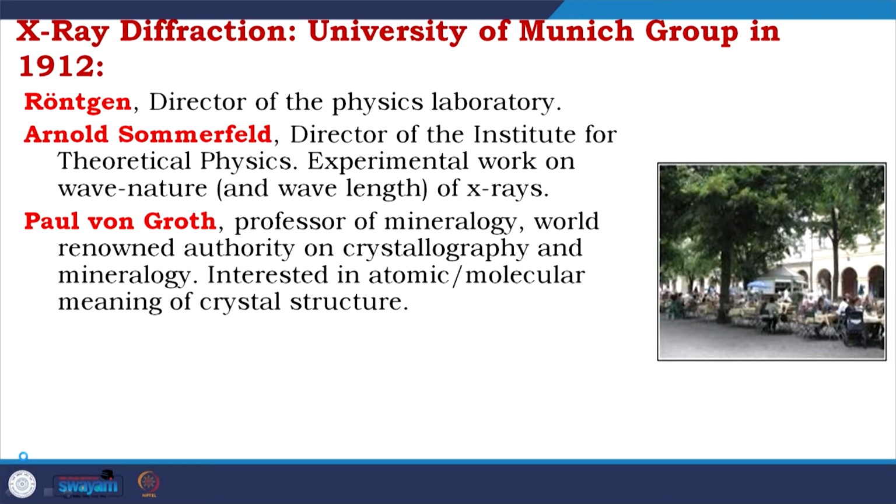As you know, mineralogy contributed to X-ray diffraction in a huge way before the protein crystallography field arrived. Actually, X-ray related research started on minerals, and then looking at the characteristic foundation, people started exploring protein.